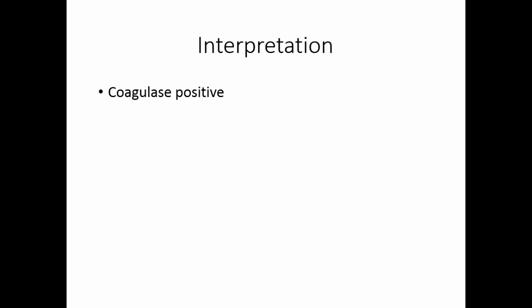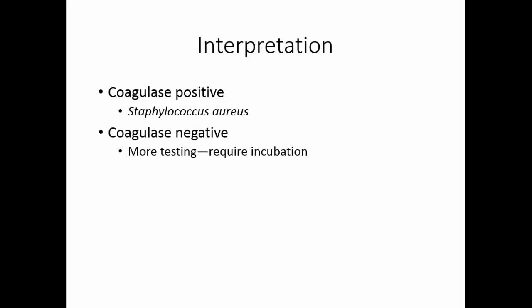If you have a coagulase positive organism, you have Staphylococcus aureus. But coagulase negative organisms will need more testing. These tests will require incubation. You will need to do the mannitol salt test and the Novobiocin susceptibility.